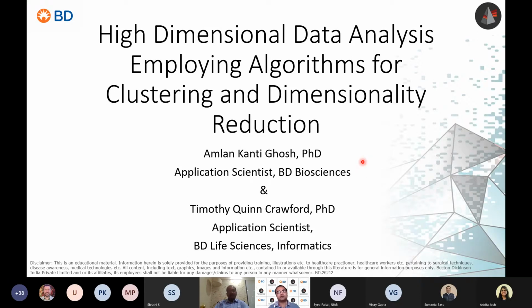So today we are going to discuss high dimensional data analysis employing algorithms for clustering and dimensionality reduction. Excuse me, I have a cold. Last session, Tim took us through the basics of FlowJo software, introduction to FlowJo, also compensation, and how to install R and plugins in your FlowJo software, which will enable us to do dimensionality reduction and all those clustering algorithms. So now today I'm going to go deep into using those plugins for your high parameter data analysis.